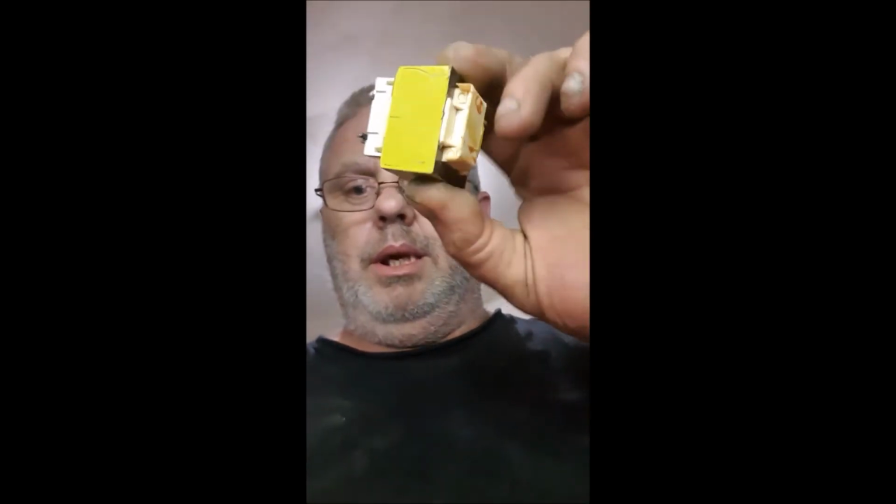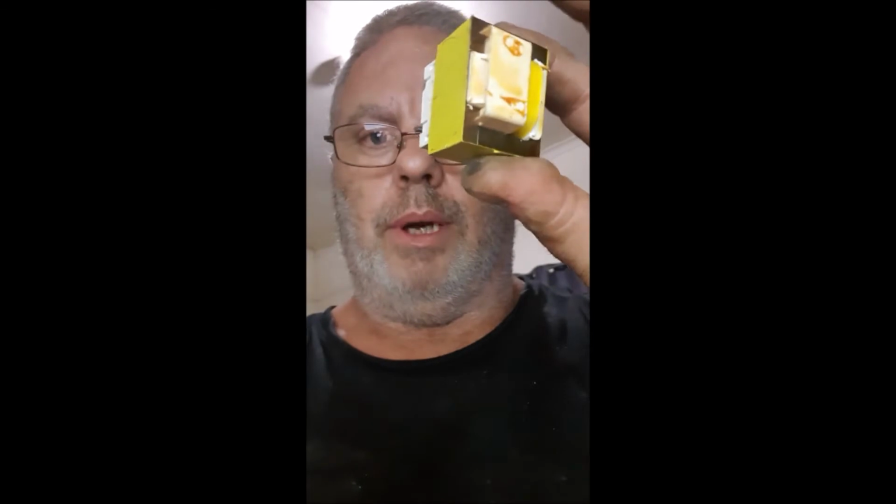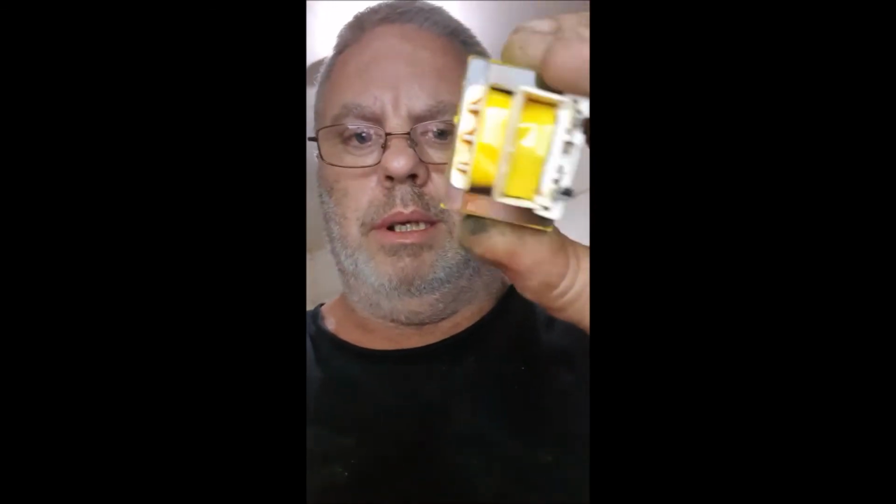I can't see any more. So transformers are what you want. If you really have to, if you don't have any of these, you can use screws, nails, things like that, but it's not advised because they have contaminants in them. They're not exactly straight iron, they're all sorts of metals, whereas these are soft iron. Even though they're thin, you'd probably class them as metal, tin, whatever, but they're not. And this is what the experts are saying to use.